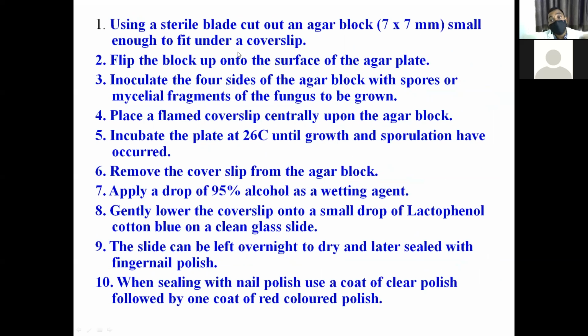We have to put the cut agar block on it and cover it with the cover slip. Flip the block onto the surface of the agar plate, onto the slide.